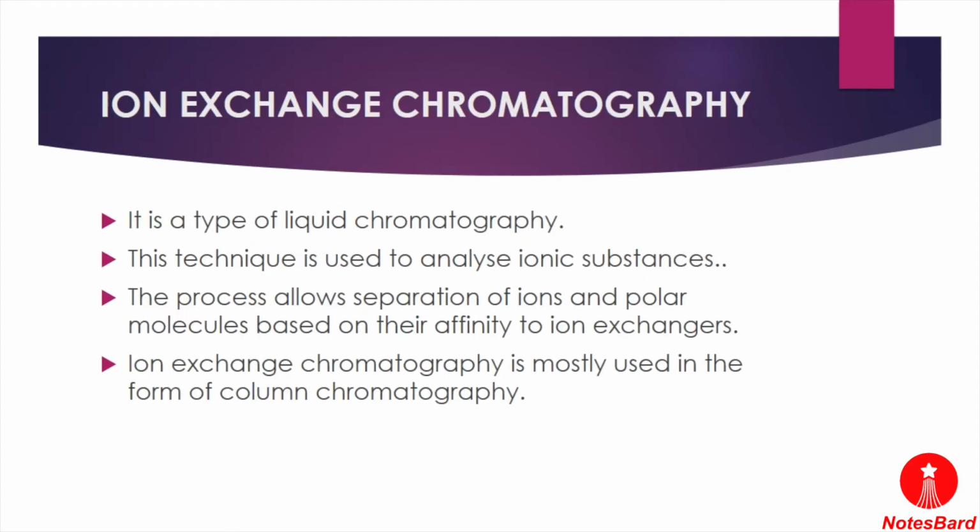Chromatography can be of different types. There are several chromatography methods which vary in their procedure and principle of working, like partition chromatography, adsorption chromatography, gas chromatography, ion exchange chromatography, thin layer chromatography, and many others. In this video lecture we will discuss ion exchange chromatography, its principle, procedure and functions in detail.